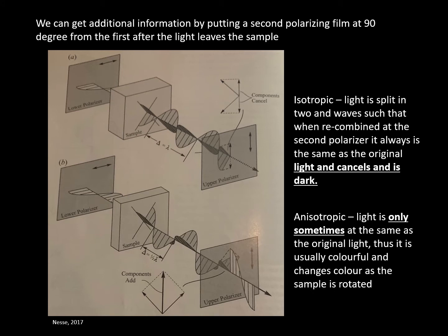So what we just saw there with the pyrite and the covellite is that we can determine whether something is bireflectant or not. If it changes colors as we rotate the stage, then it's bireflectant, and depending on those two colors, we can use that for mineral identification. And in the case of pyrite, which is not bireflectant, the fact that it's not bireflectant is one of the properties of pyrite that can be used to identify it.